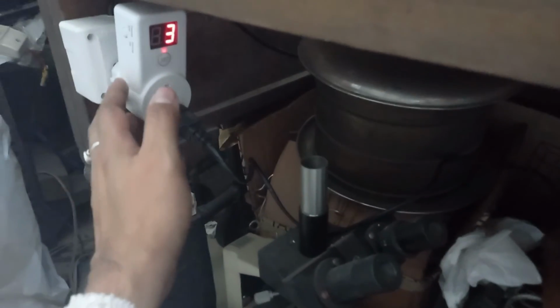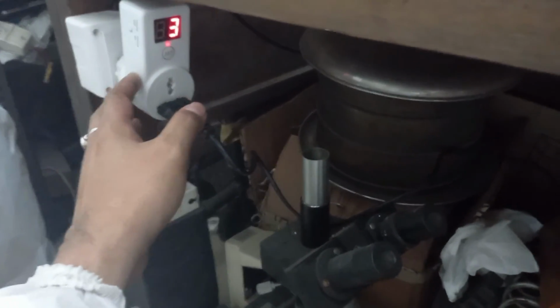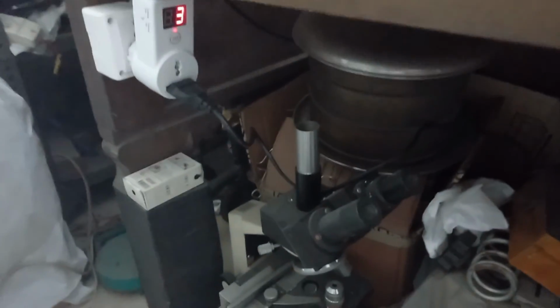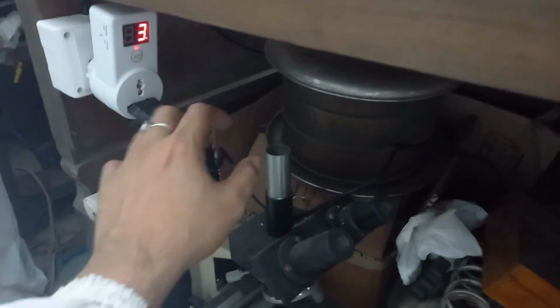No matter how much you want, you can increase this timer and set accordingly. This small gadget is around 500 rupees. You can purchase it from Amazon, and your UV cabinet will be ready. At the end of the day, you can just switch on this timer and leave the lab, and it will be automatically switched off when the timer ends.